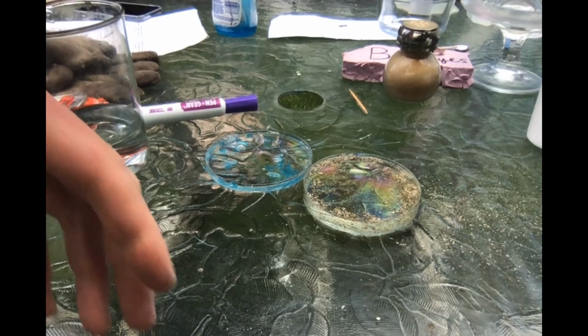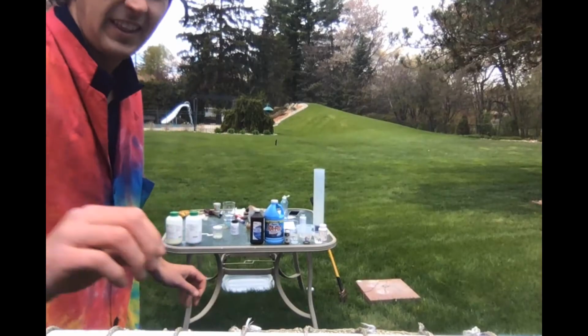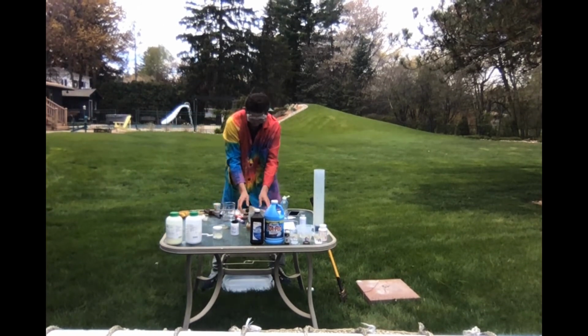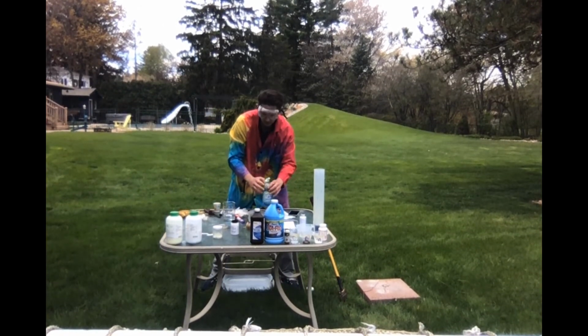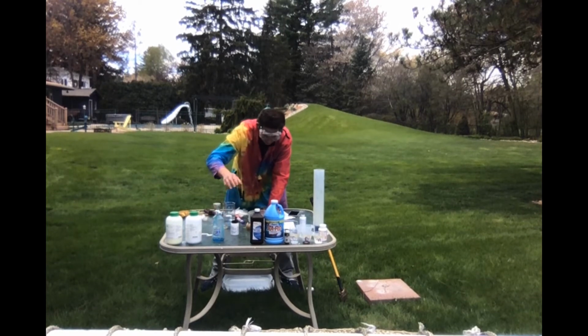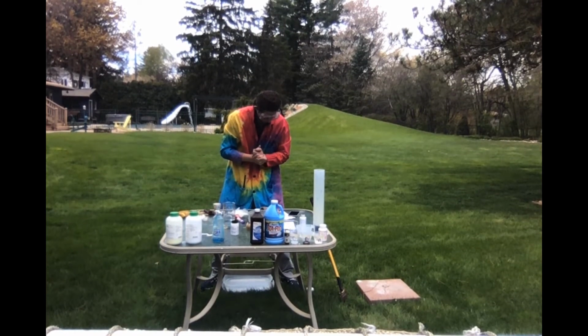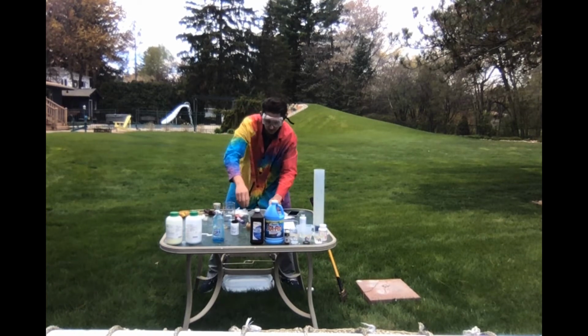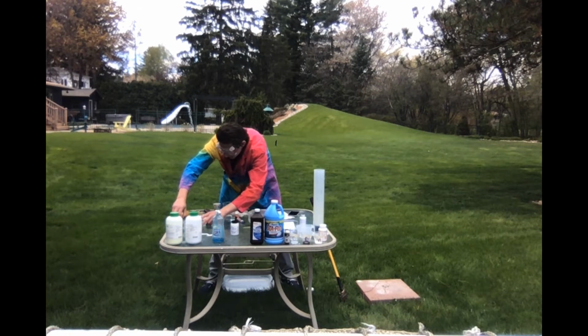Next, iodine clock. All right. The iodine clock. We're going to deal with some chemicals here. The iodine clock is something, believe it or not, that I haven't done. So, wish me luck with this. All right, the iodine clock. I'll move all that over to the side.